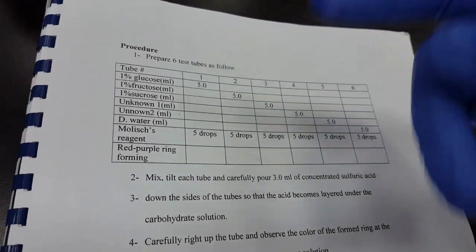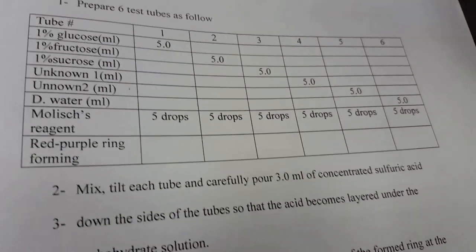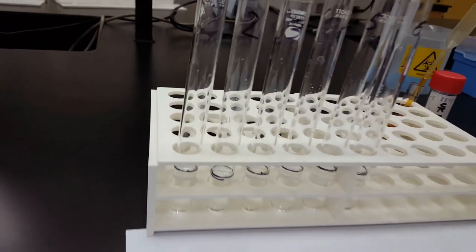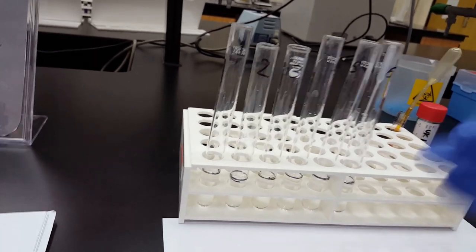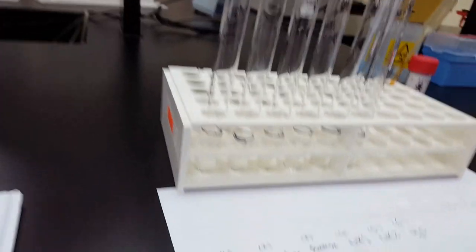Once we are done, we have to start adding 5 drops of what? Of Molish reagent. The Molish reagent is here, as you can see. We have to add it to all of the test tubes. How many? 5 drops to each test tube. Once we are done, we take those test tubes under the hood. What do we have to add now? The concentrated sulfuric acid.